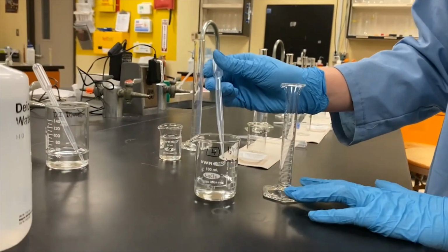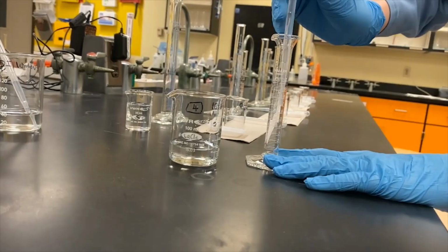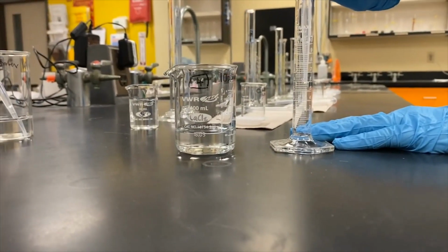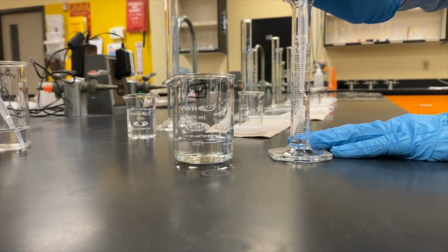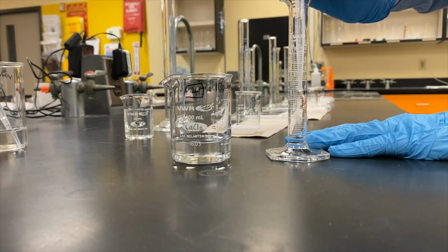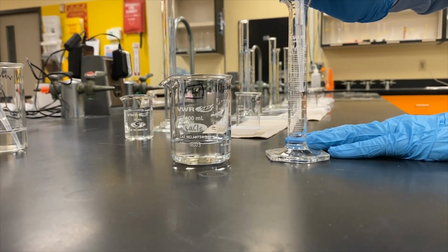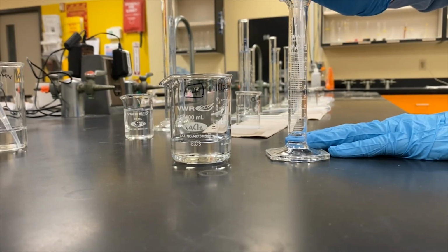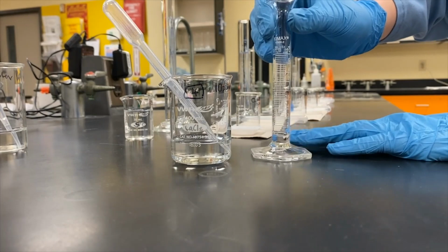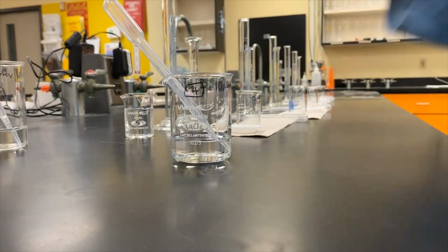I'm going to use a disposable pipette because it's such a small amount, I don't want to over pour here. So I'm going to bend at the waist to make sure I've lined up the lines of the graduated cylinder here. And I don't want to bend at the knees, because if this chemical does spill into my face, bending at the hip allows me to have a better reaction time than bending at the knees would, and it reduces the danger here. So I've got a very accurate 1 milliliter here.